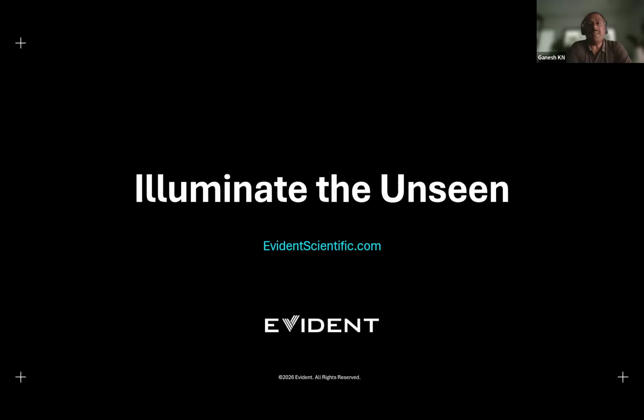Because of this, people decided that we should have a better detector. And if we can use a conventional camera which has better sensitivity and quantum efficiency, then you have to have multi-point excitation, switching over from a conventional point scan, single point excitation to a spinning disk confocal microscope where we used a Nipkow disk with multi-point excitation.